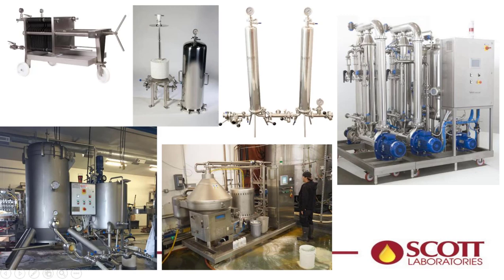It's a sterile membrane. You'll hear people say, oh yeah, I EK filtered it, or 0.45 filter, and that's sterile in a plate and frame. That is not the case. You cannot get sterile with these two. The only way you can do it is with a membrane filter, because you can test the membrane. You can't test the integrity of these things.